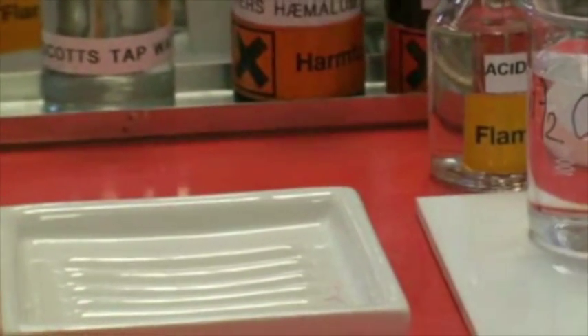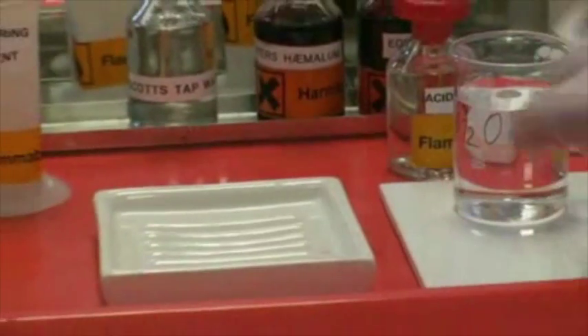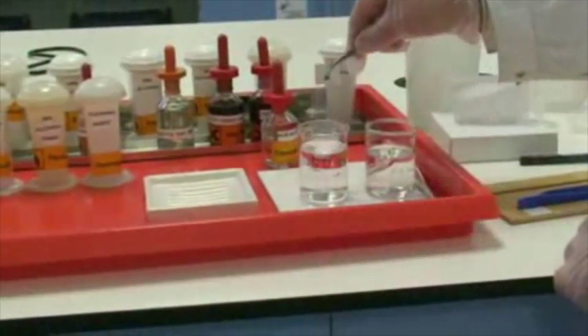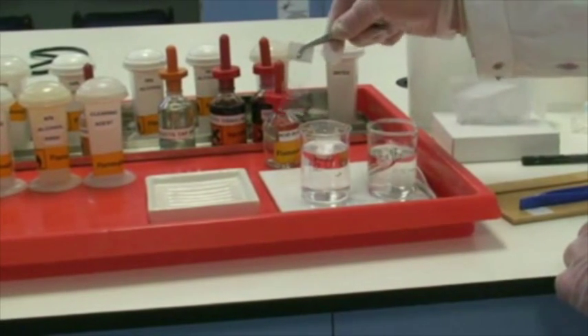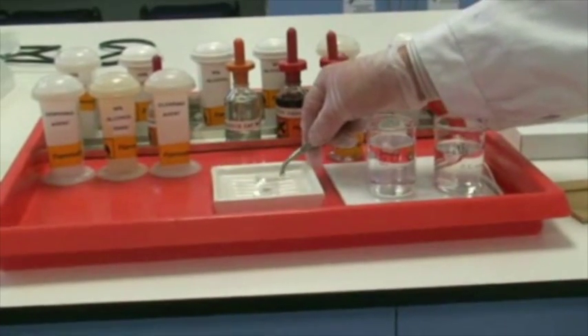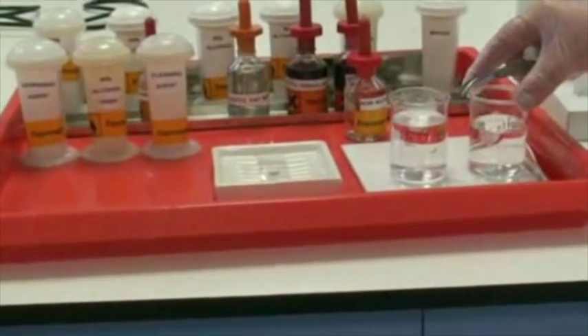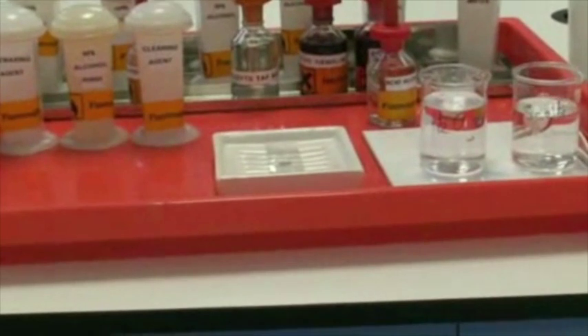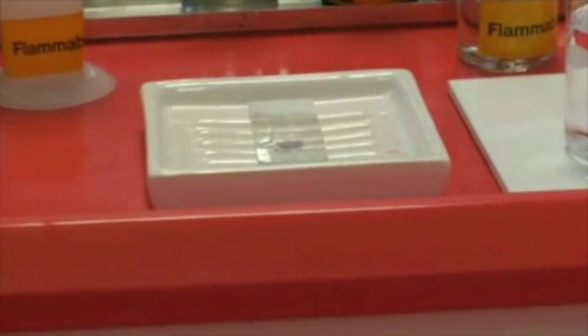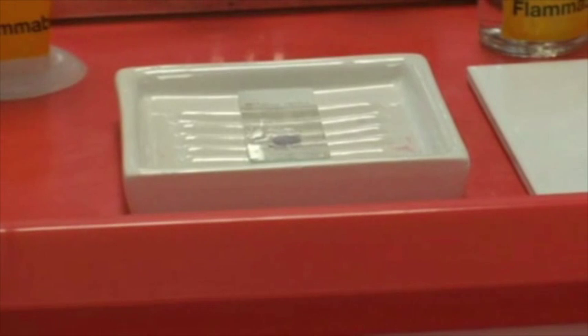We're now going to rinse briefly in water and we're now ready for our next step, which is our Eosin stain, which is our cytoplasmic stain. Just to remember, Hematoxylin is a nuclear stain. Our next stain will actually stain the cytoplasm and other such cellular components.